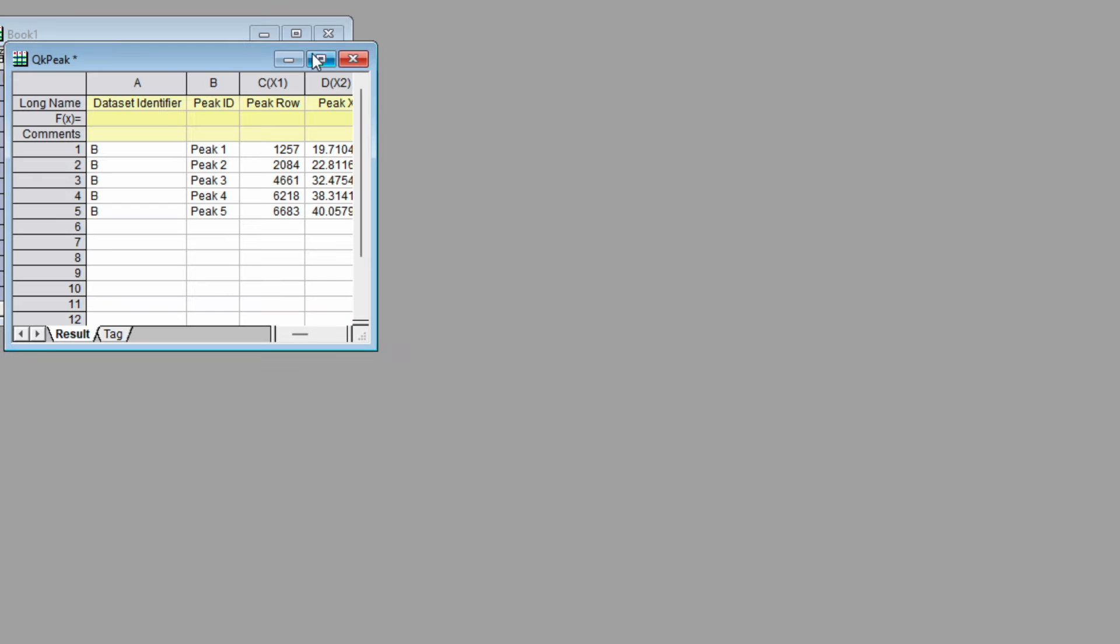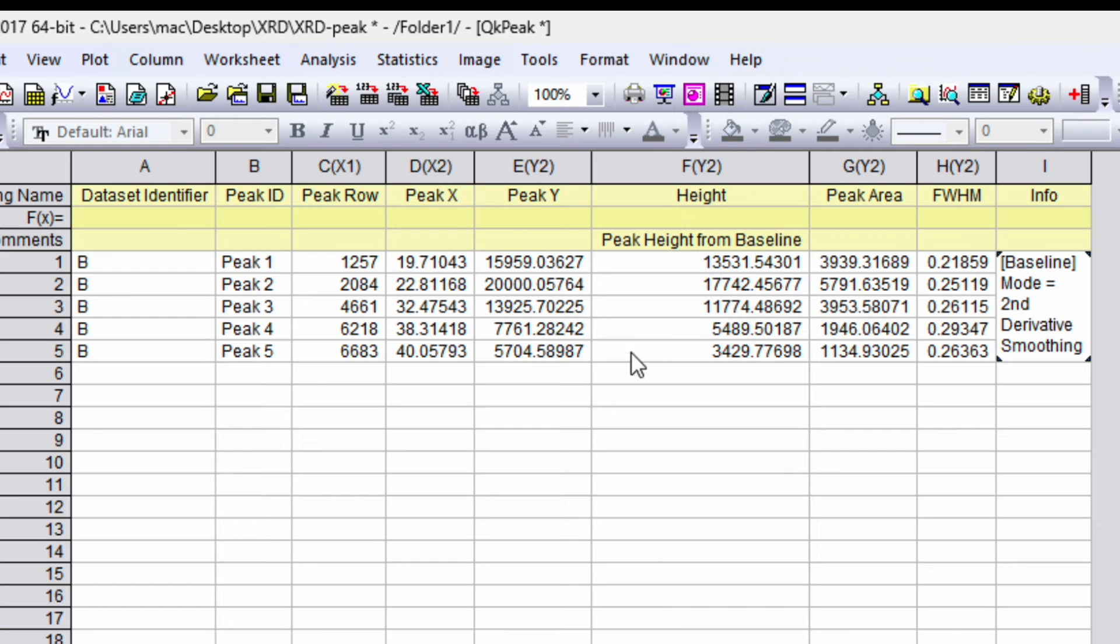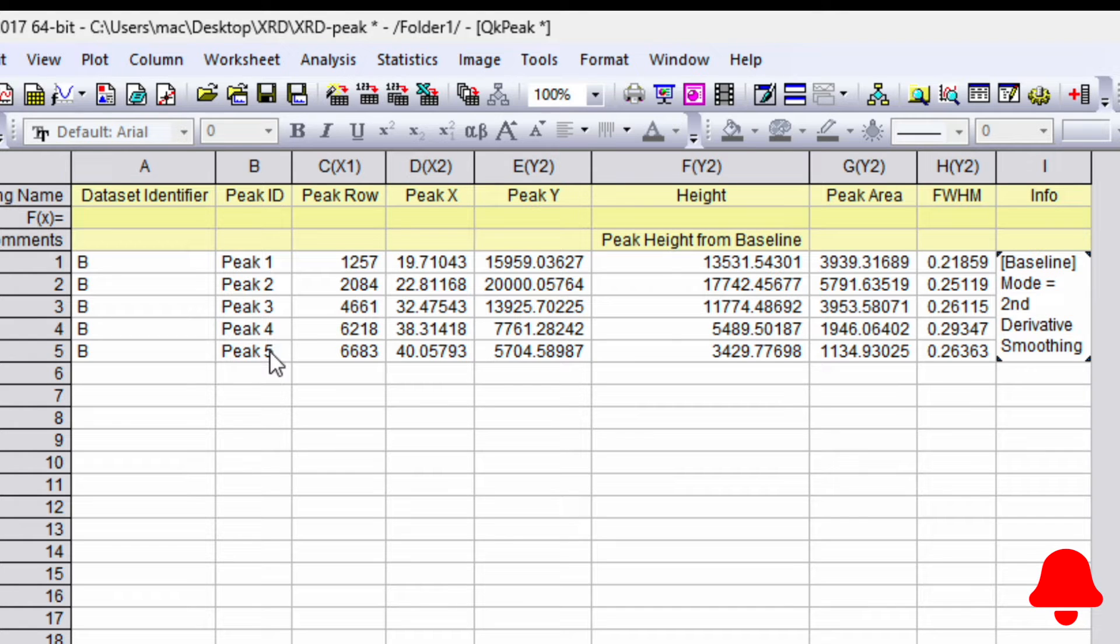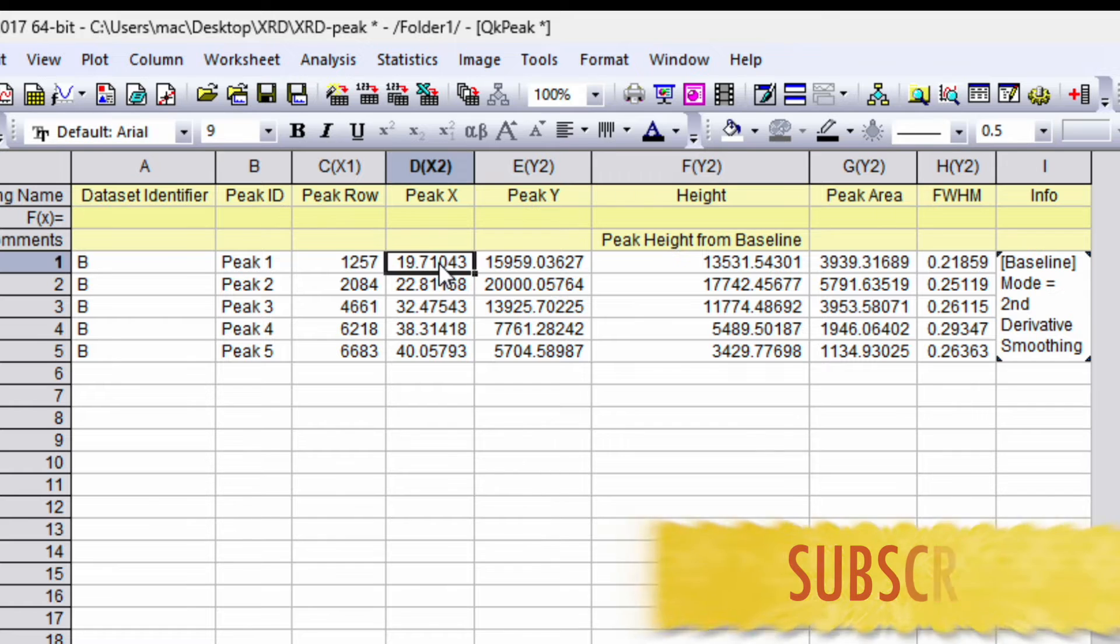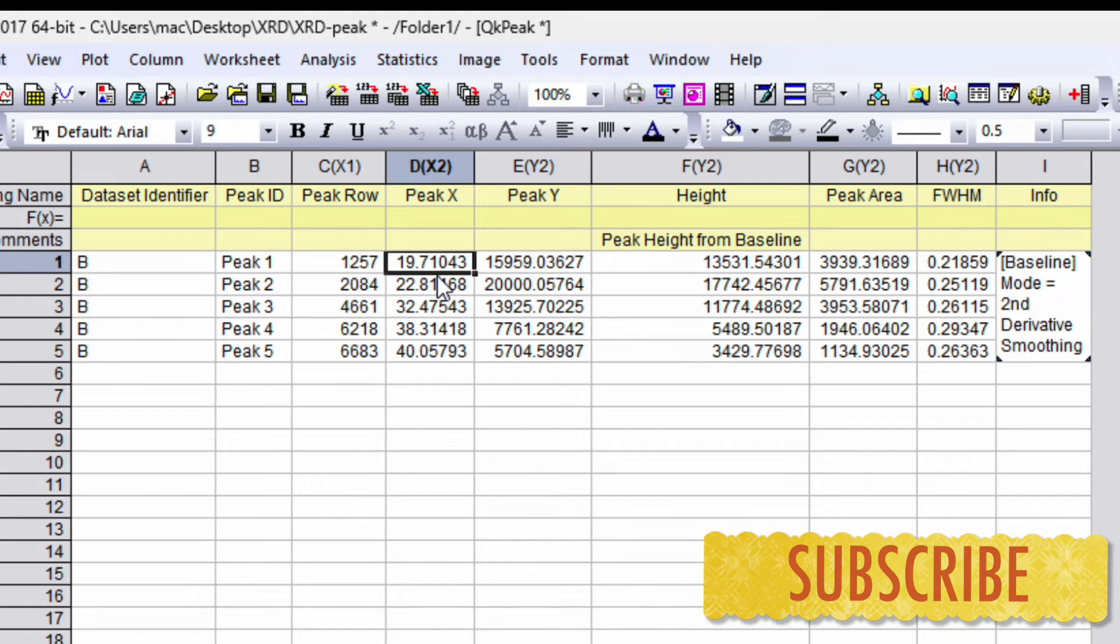Now go ahead and minimize this window. Maximize this one. So over here you can see all five peaks, full width half maxima as well as peak center. These are the peak centers for all five peaks.